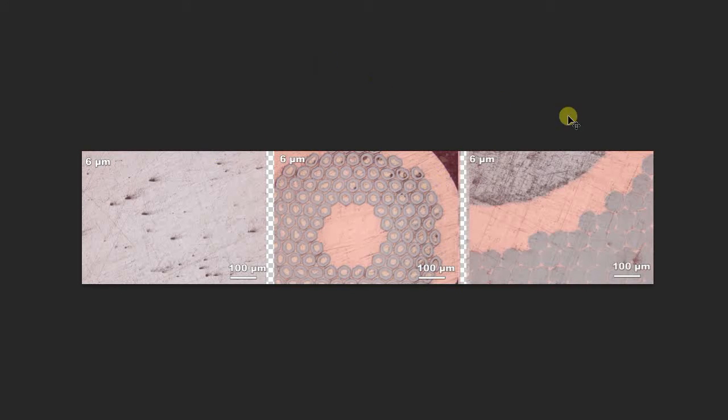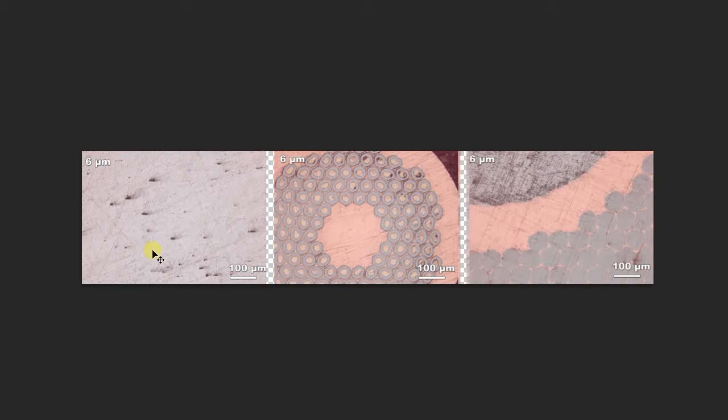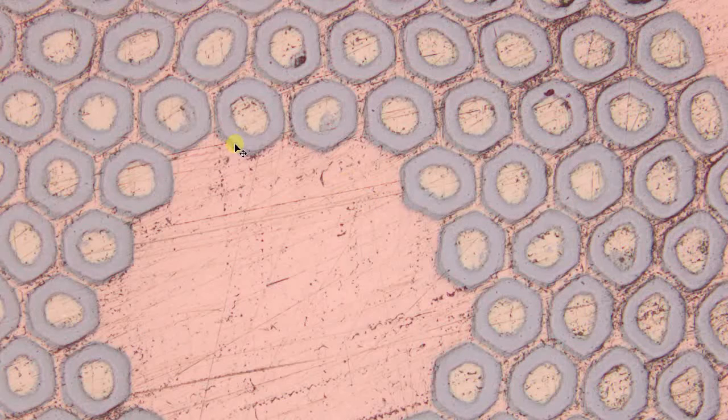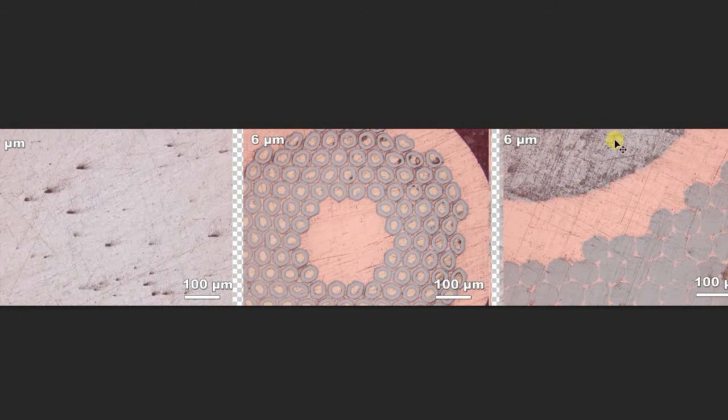Look at the huge difference this made. This is the 6 micron step versus the previous 8 micron. Notice how clean the aluminum block got — that change is huge. The niobium here looks virtually scratchless. There's more to be done, but it's making everything much better. These diamond suspensions are great. Notice how some materials polish at different rates than others. All the damage you see on this soft tin is because it was soft and is still from the 8 micron run. They will go away if you keep doing more of these.